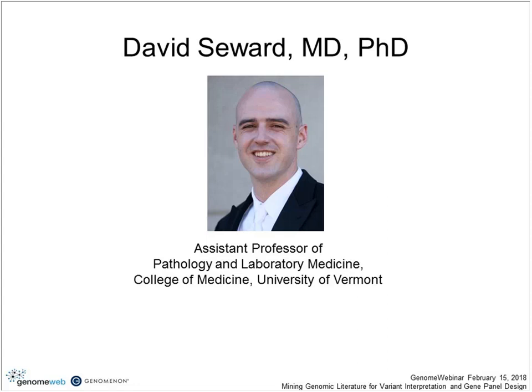So, like Nikki, my clinical work is focused on molecular genetic pathology, and I'm one of the people who signs out the assay that Nikki described here at UVM. And the goals I have for today are to basically give everyone a flavor for what using Mastermind in the context of a genomic sign-out is like on a step-by-step basis. And to accomplish this, I've picked a couple of cases I've signed out in the last 6 months or so that I think will help illustrate the benefits to using this software and how it has directly impacted my clinical sign-out in my work.